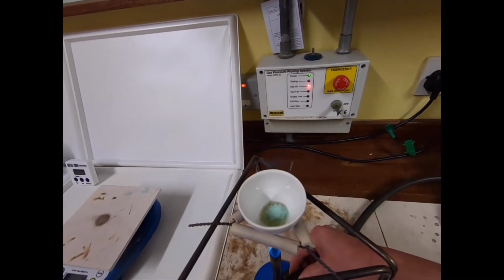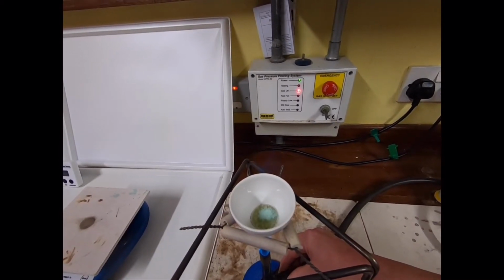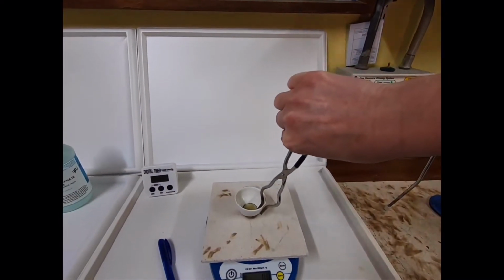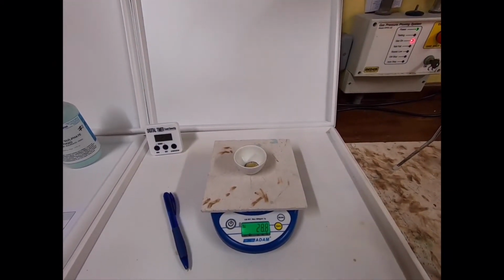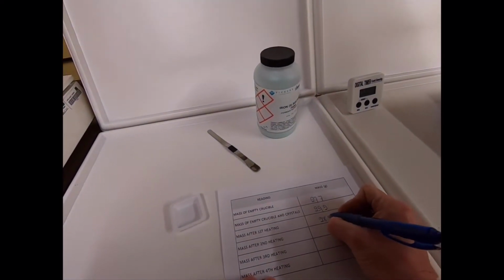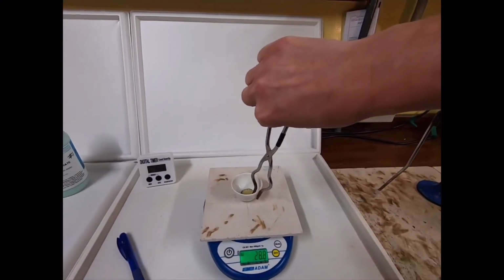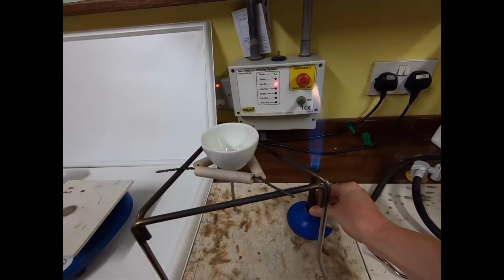You can see the colour is gradually changing. It's going from its blue colour to a white powder as the water is removed. Now, once you have heated it, you allow it to cool, and then you can pick it up and put it on the scales to find out its mass. You can see there the mass has dropped significantly, so it's now down to 28.8. So just record that in your table, and then you're going to get ready to heat it again. When you heat it again, that means that any of the substance that hasn't reacted will get a chance to react. And we're then looking for two measurements that are the same mass.